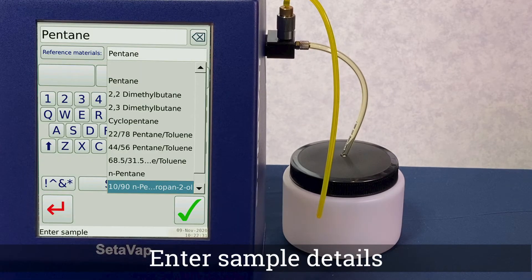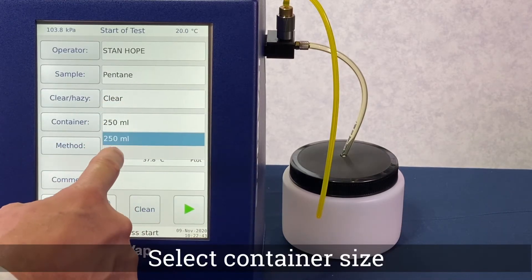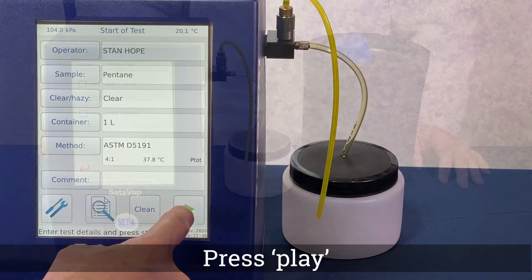From the sample menu, click on the reference material field to see a list of the pre-loaded options and select accordingly. Select your container size and then press the green play button.